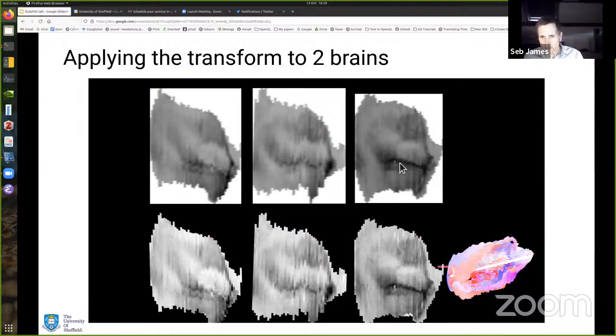But what we've got here on the right is the first brain. This is all layer 2/3 expression in 3 different vole brains. You can see that the individual slices are straight in this map, so this is the template brain. And then these 2 other brains have had the transformation applied to them, so they've got different amounts of twist to them.